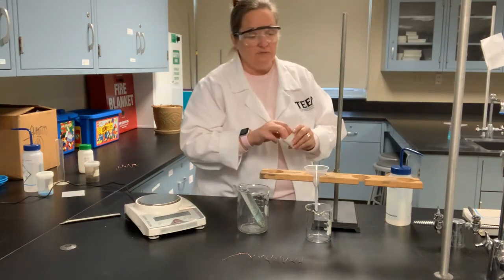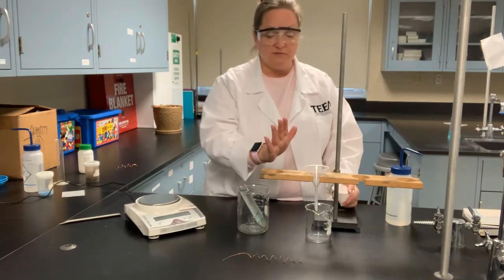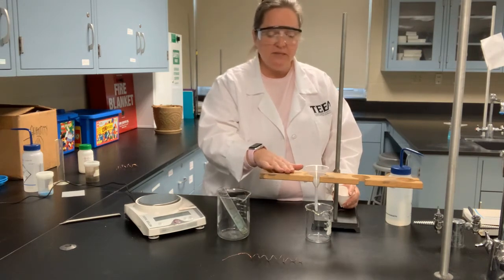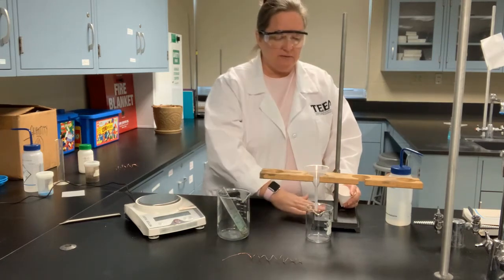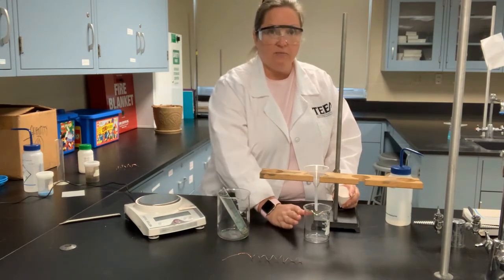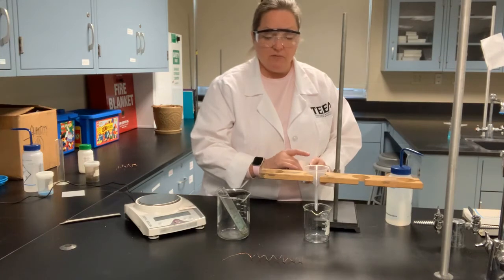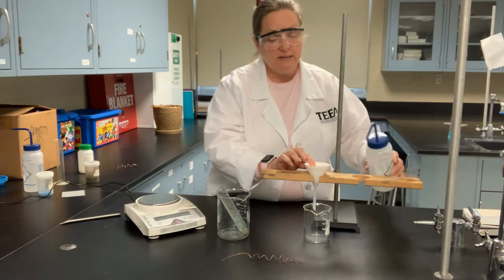Now I'm going to place this filter paper into my funnel, and I've got a filtration setup here. So this is referred to as a filtration apparatus. This wooden piece of equipment here is a funnel stand. It clamps onto the ring stand. This is the ring stand, and I just have an empty 250 milliliter beaker underneath. I don't need to worry about keeping track of the mass or labeling the beaker because I'm not actually collecting the filtrate here, which is what we refer to as the solution that will pass through the filter paper. What I'm concerned with here and what I want to collect is the silver.